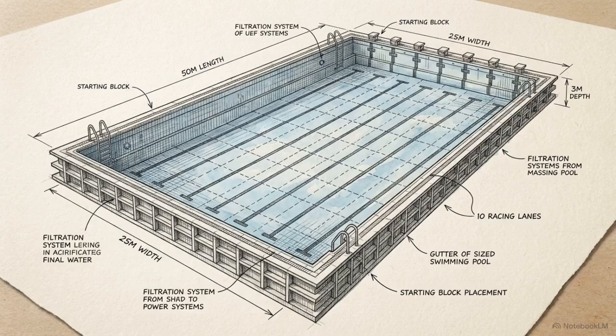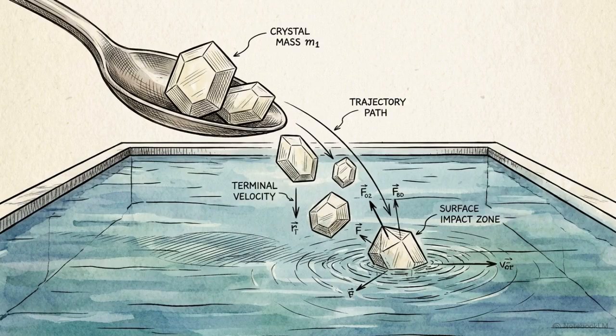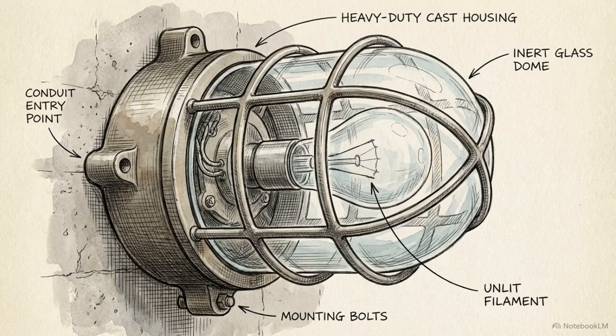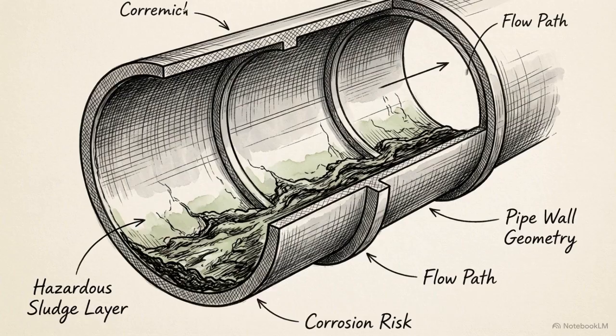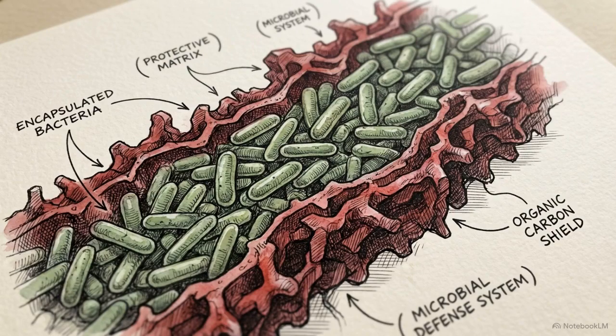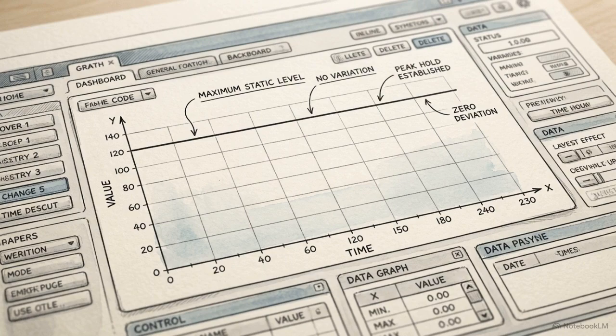To put that scale into perspective, 500 parts per billion is equivalent to dissolving half a teaspoon of sugar into an Olympic-sized swimming pool. Many engineers treat that 500 parts per billion ceiling as the only metric of success. They wait for the water to approach that line before taking action. But any rising organic trend, even well below that 500 limit, means contamination is actively building inside your pipes, shielding pathogens and allowing biofilms to take root. You cannot manage what you only measure at the ceiling.